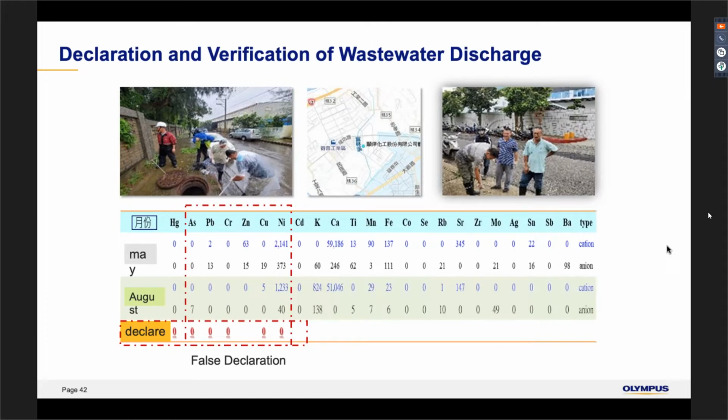Yes. So for the tiers itself, Prof. Chang and his team spent quite a lot of time building a calibration for the XRF. So he also used ICP and AAS results to build his calibration, so that you can use the portable XRF in the field to get a quick screening of the result itself. So that's the whole purpose of the equipment. But like what Prof. Chang has mentioned, ultimately, if it comes to the final enforcement stage, they will still need to put it through AAS or ICP.